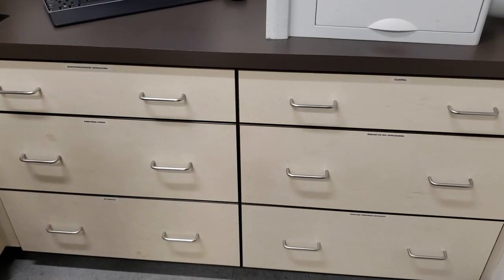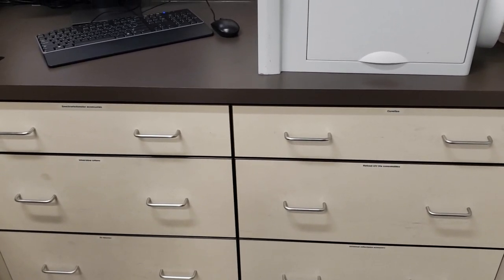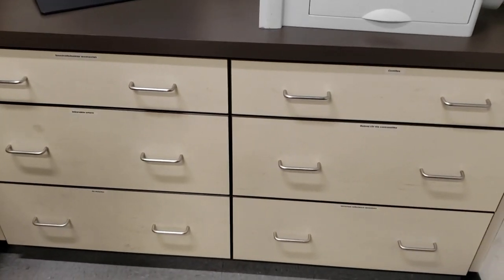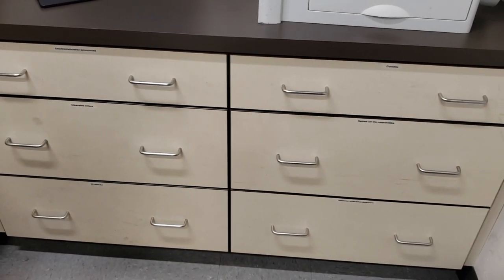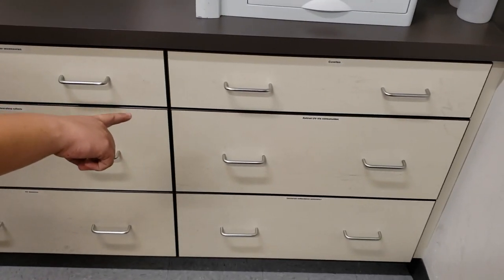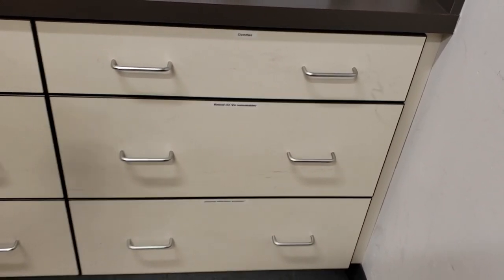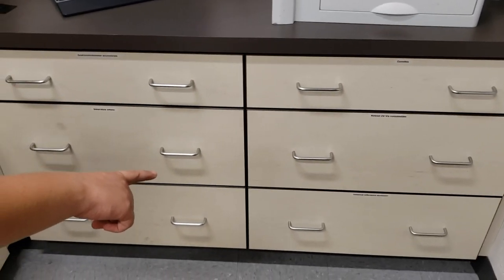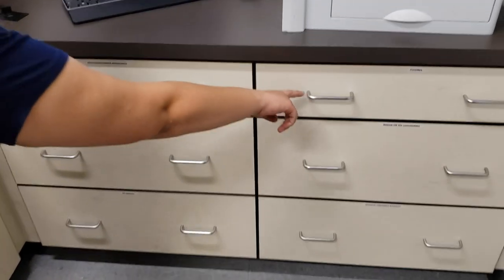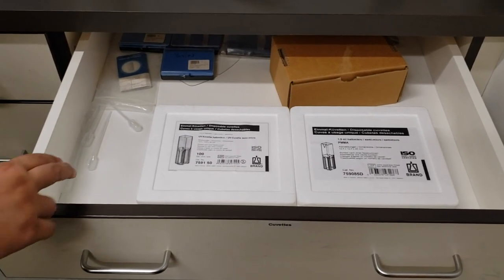These are the drawers directly beneath the computer. If you're facing the UV-Vis and you turn to the right, these are the drawers underneath the desk space. Most of these drawers are accessible to you. The only drawer you won't need to use is the middle right side that says 'Retired UV-Vis Consumables.' All of the rest are available to you. This top drawer has cuvettes in it. We have two different kinds of cuvettes for analysis.